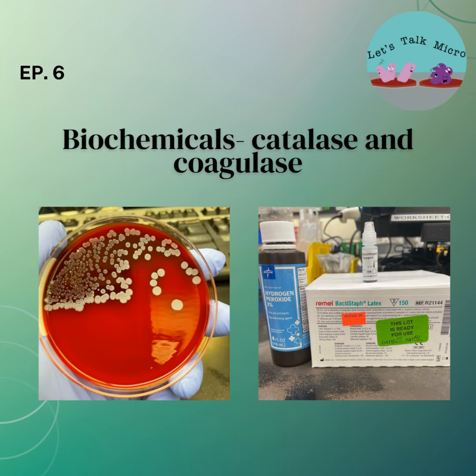And also with the alpha colonies, with the elderly patients, you do a wet mount, you can see sometimes the cocci in clusters. If you're not sure, just go ahead and do an ID. I mean, not quick, but you can do a Vitek or a MALDI-TOF, whatever system you have, because you need to rule out Aerococcus urinae, which causes UTIs, urinary tract infections, in elderly patients.